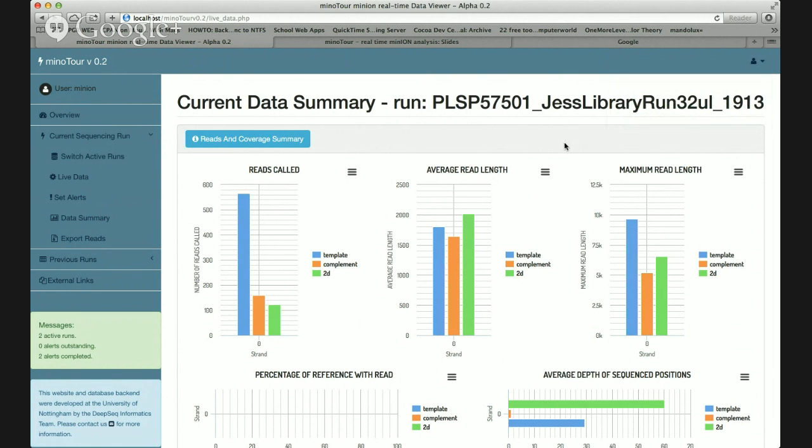You could imagine screening for particular pathogens and being alerted if a sample picks up a particular sample or species that you're worried about. Those alerts could very easily be even sent to your mobile phone rather than you having to sit and stare at the screen. So that's a pretty quick overview.